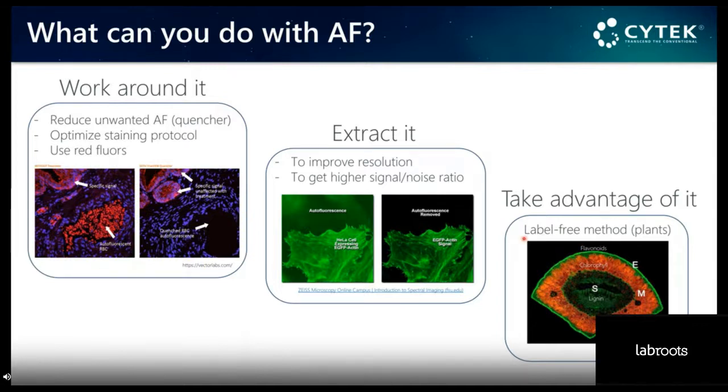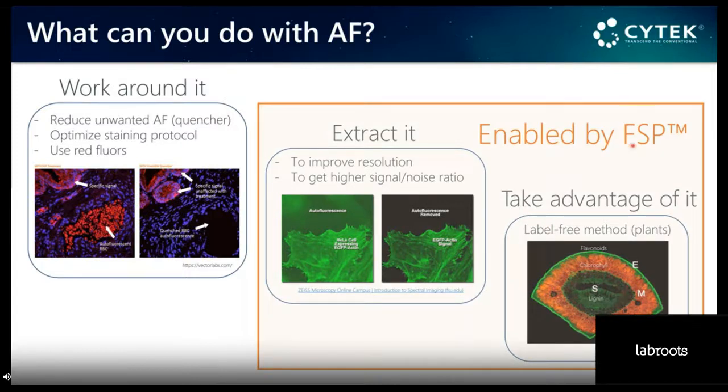So full spectrum profiling, going back to the other player in the talk, is a technology that enables you to either characterize this autofluorescence and remove it by doing extraction, or use all the natural staining in your sample to answer any scientific question you might have.